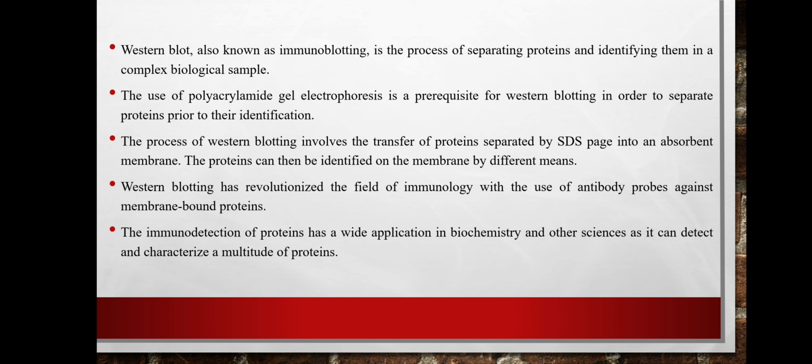The process of Western blotting involves the transfer of proteins separated by SDS-PAGE to an adsorbent membrane. Then proteins can be identified on the membrane by different means. Western blotting has revolutionized the field of immunology with the use of antibody probes against membrane-bound proteins. This immunodetection of proteins has a wide application in biochemistry and other fields of science, as it can detect and characterize a multitude of proteins.